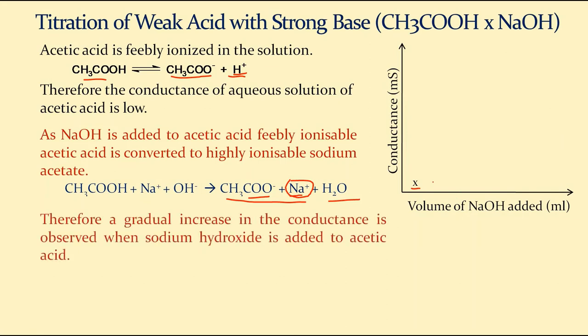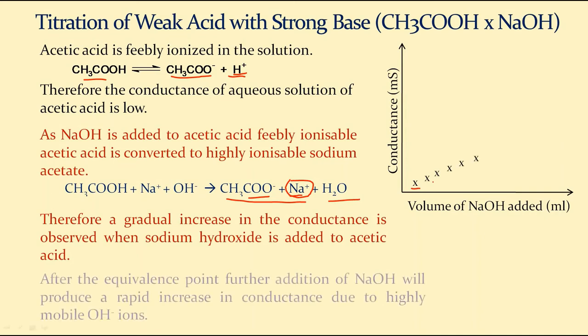So here you can see the readings are slowly increasing as the number of sodium ions increases in the solution, till we reach the equivalence point. Beyond the equivalence point, sodium hydroxide is added.